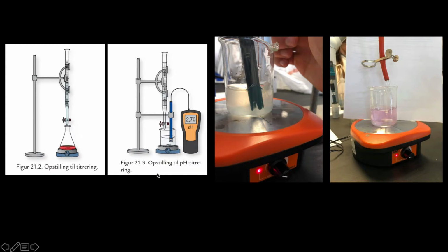We used a graphical analysis program and a pH meter to measure the pH value, so we could see the correlation between the two, and it was about the same. I think we used about 19.4 milliliters to change the color here, and the endpoint in the pH titration was at about 19.25 milliliters. So that was kind of the same thing.